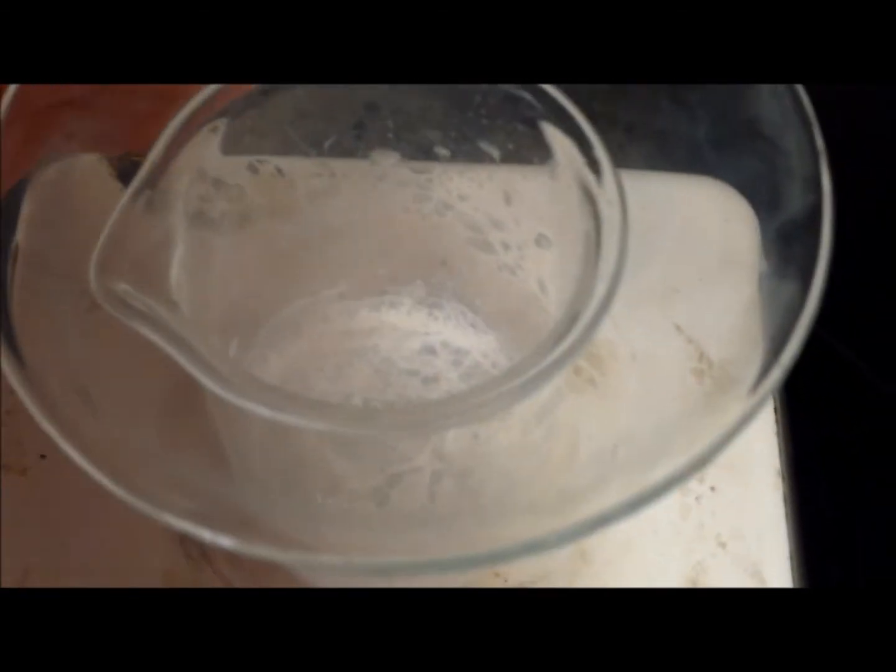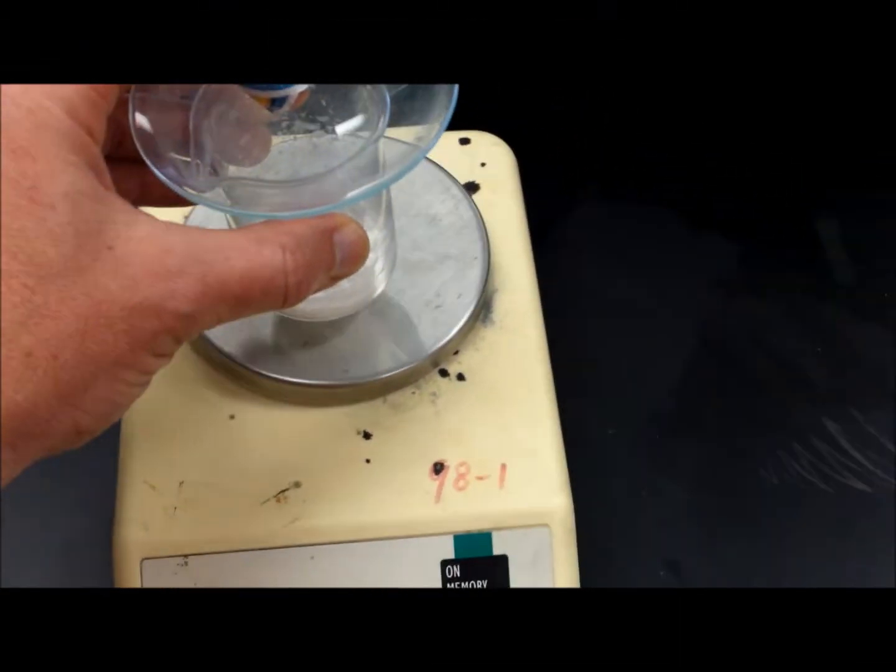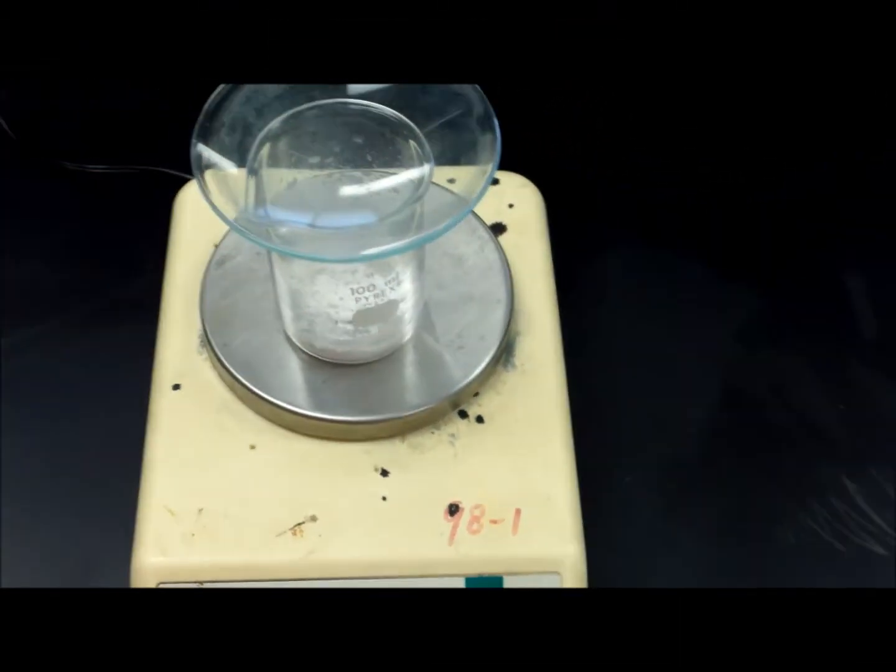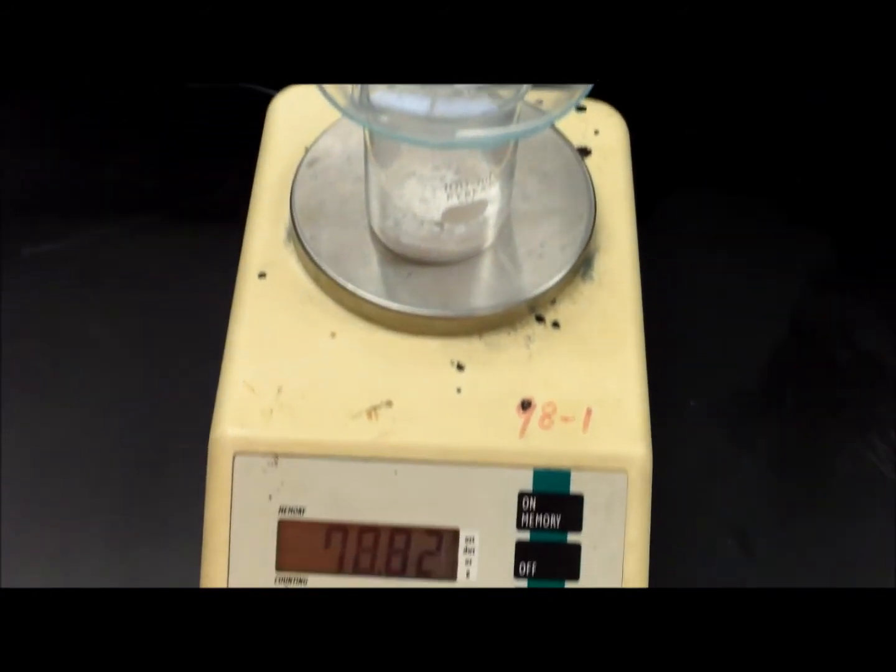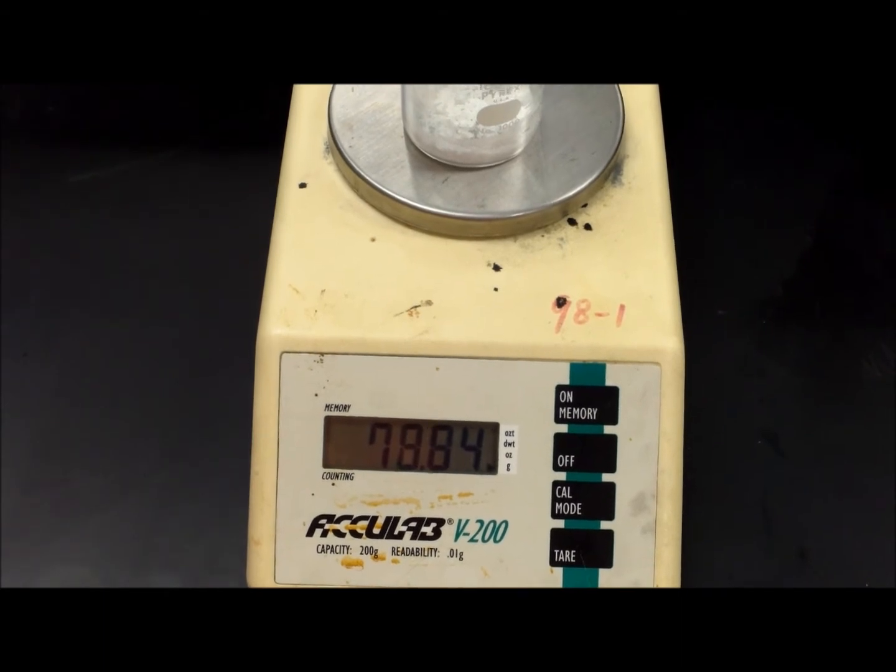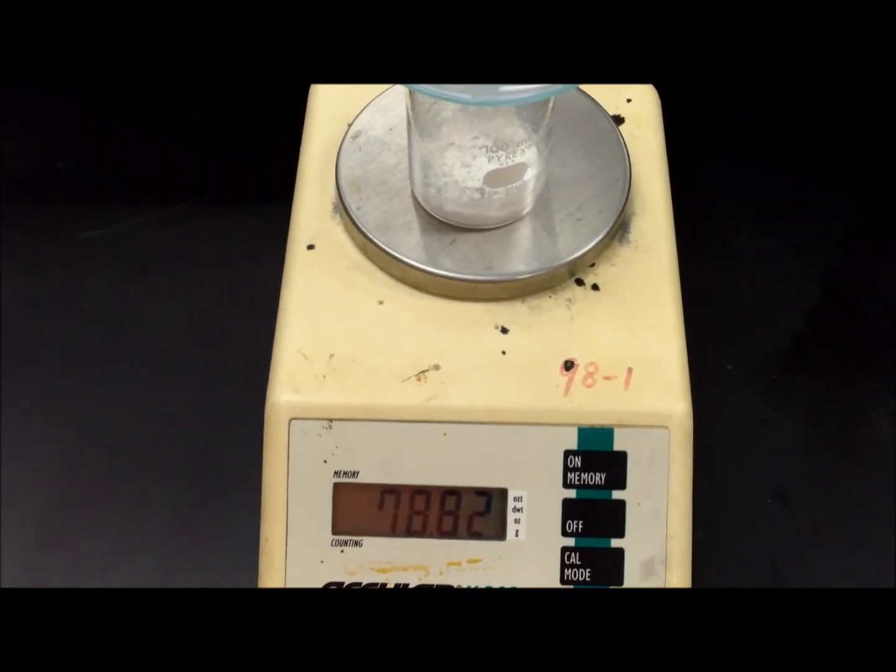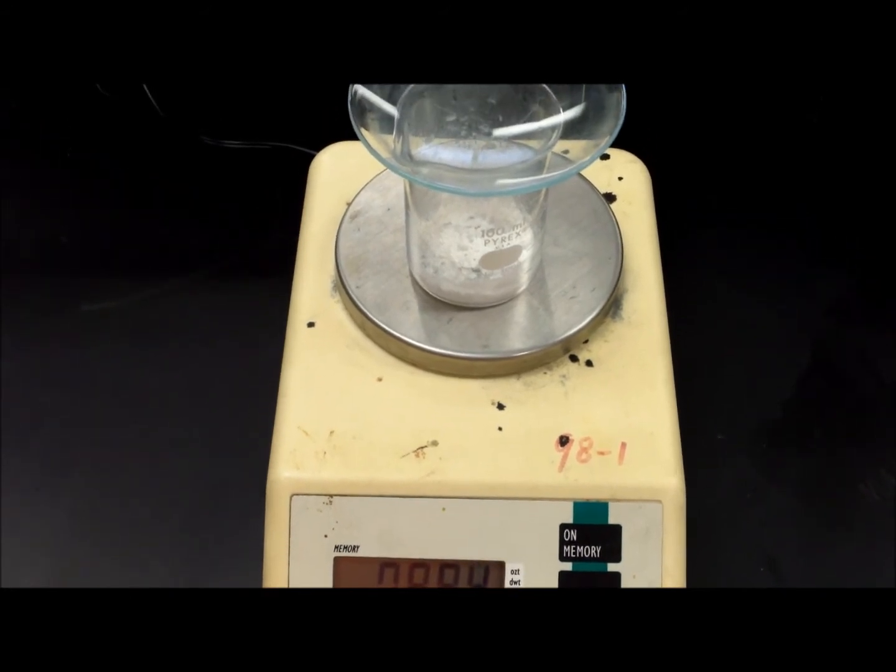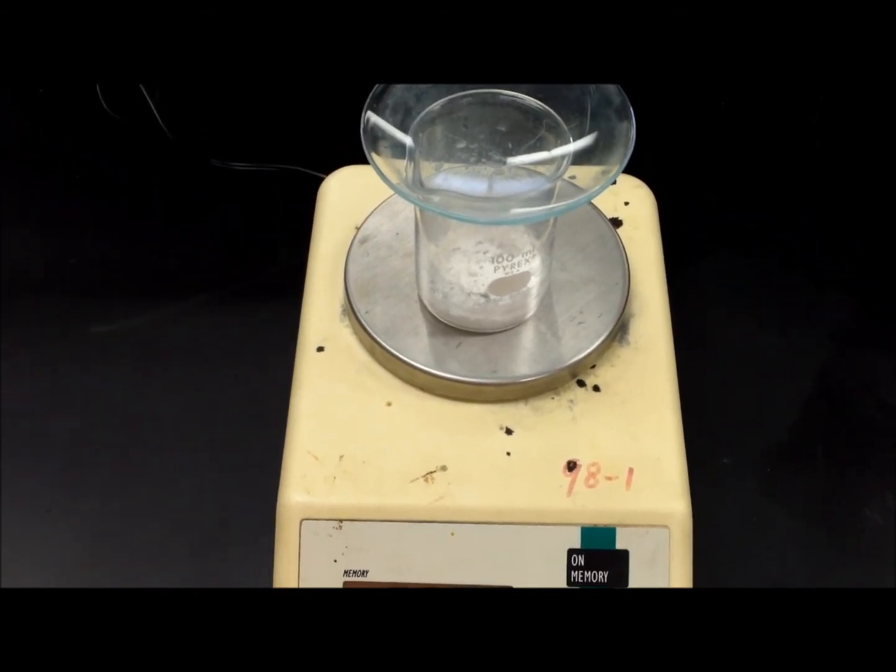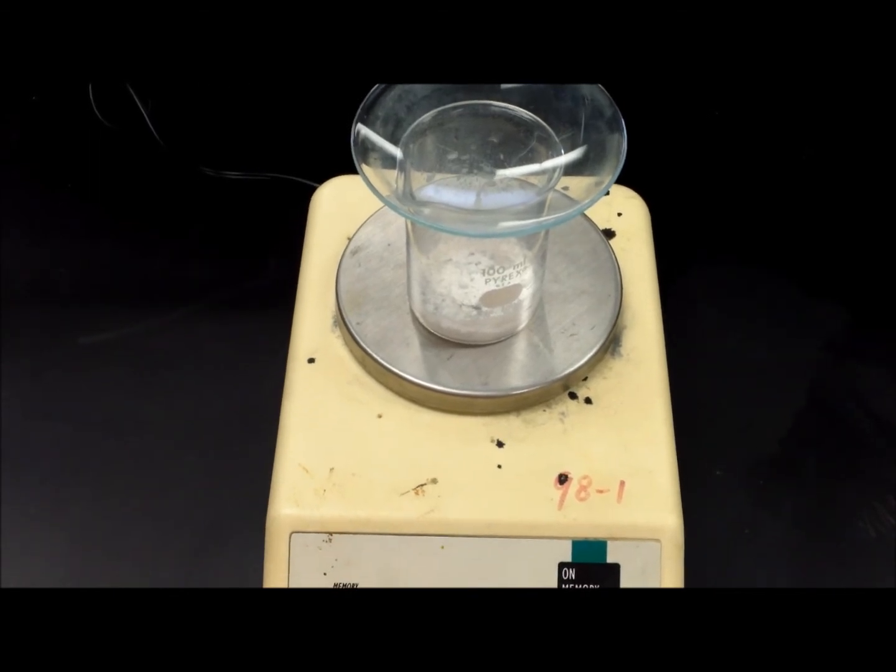Let's get a mass measurement of this sample. We will mass the sample together with the beaker and the watch glass. So we're getting a mass of 78.84 grams. Now we want to verify that this is a dry sample, so we're going to go ahead and heat the beaker for a little bit longer just to make sure that there's no additional water hiding out in the salt.